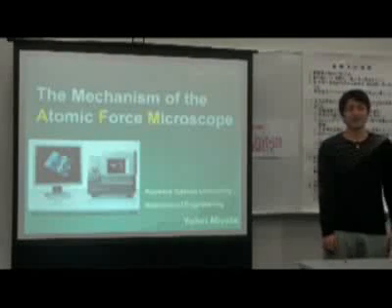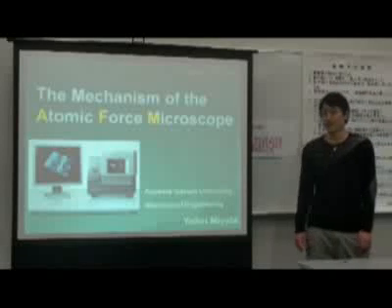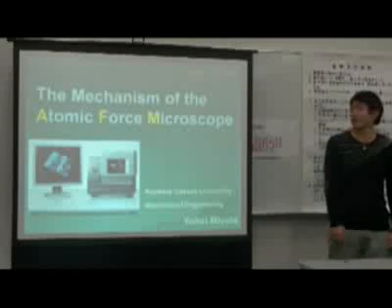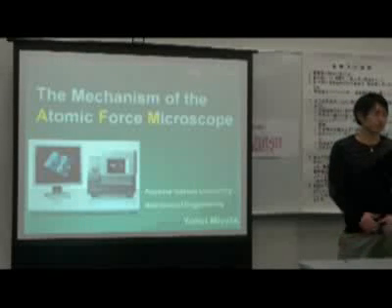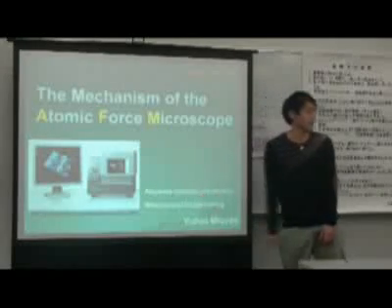I am from Queen's University, and I'm studying mechanical engineering. Today, I will explain to you the mechanism of the atomic force microscope. We usually call it AFM from its initials. This picture is the AFM used in my laboratory.